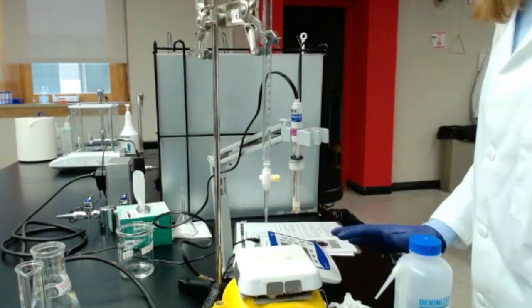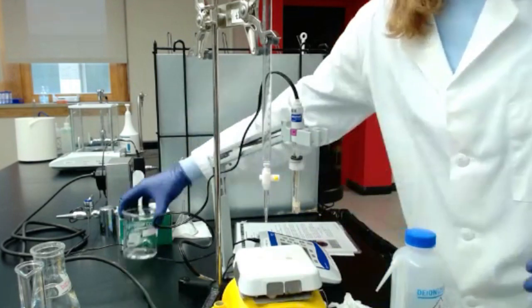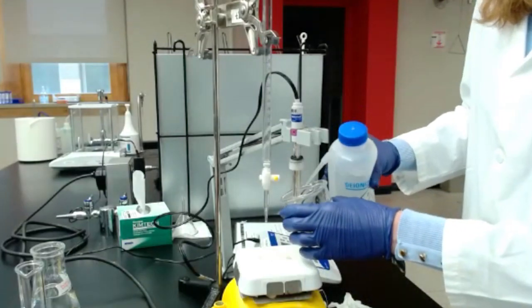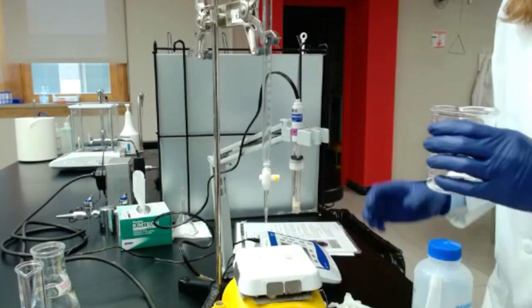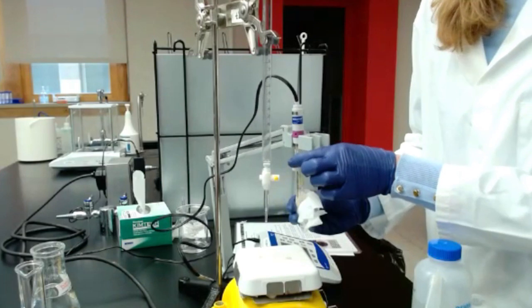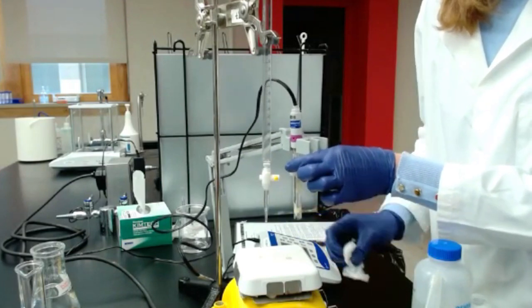So once you use the first pH and you did the calibration on the first pH solution, then you rinse again with your DI water. You clean or you dry again. And that's really before moving on to the next buffer solution.